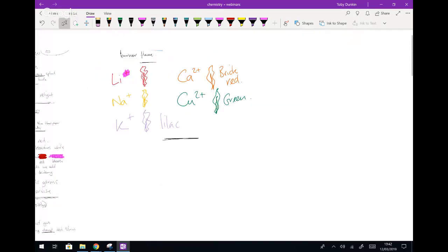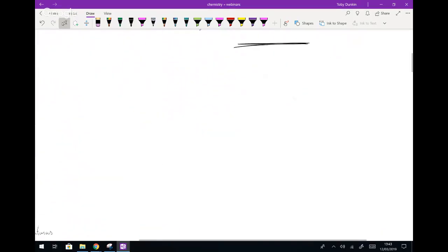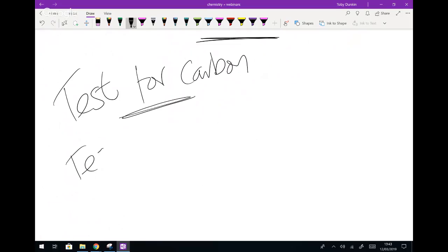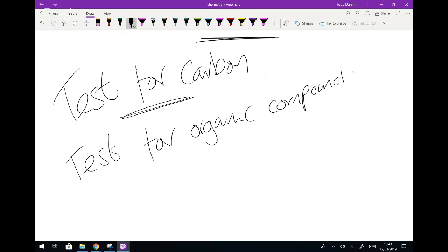Okay, so our flame tests are done. I do want to now shout out for one more Bunsen burner style test, which is a test for carbon, otherwise sometimes known as a test for organic compounds.